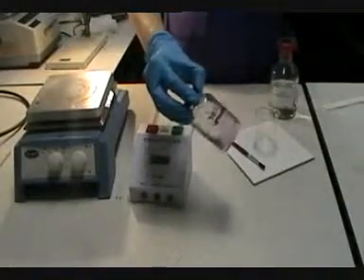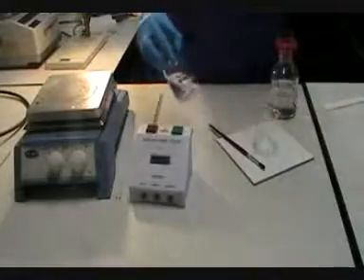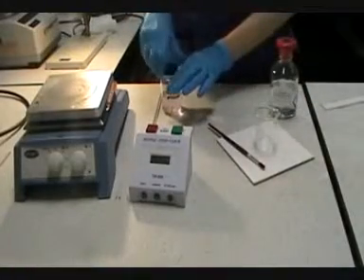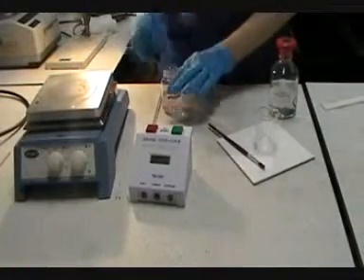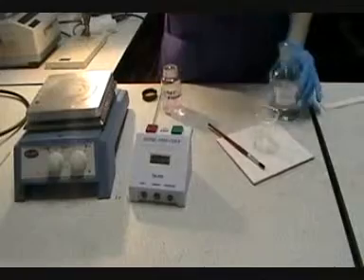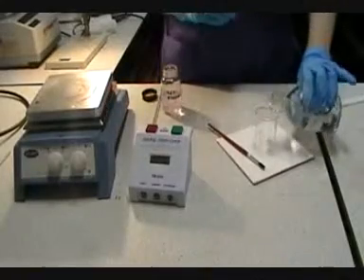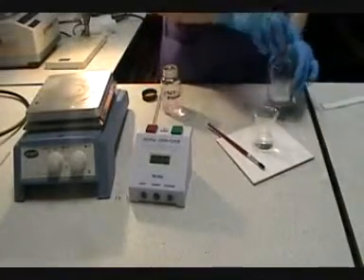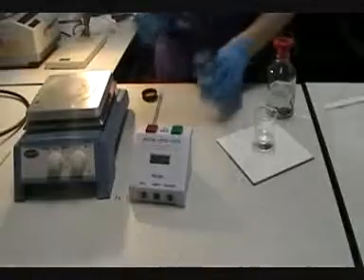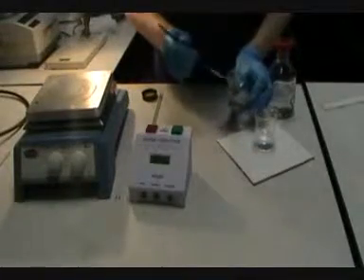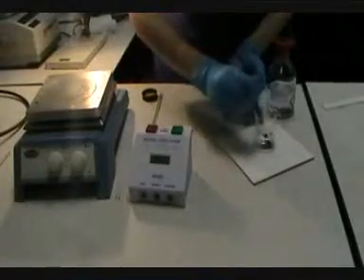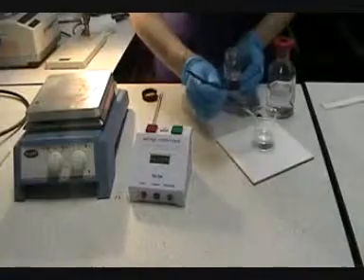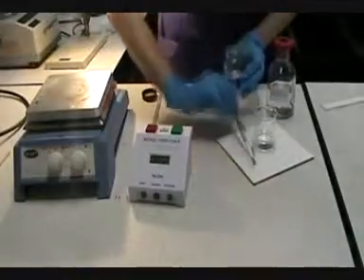The root tips have already been fixed and stored in 70% ethanol. They are then placed in one molar hydrochloric acid at 60 degrees Celsius for six minutes.